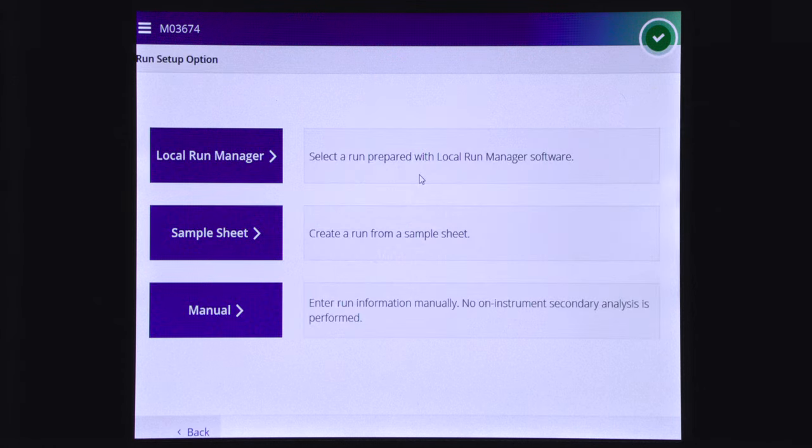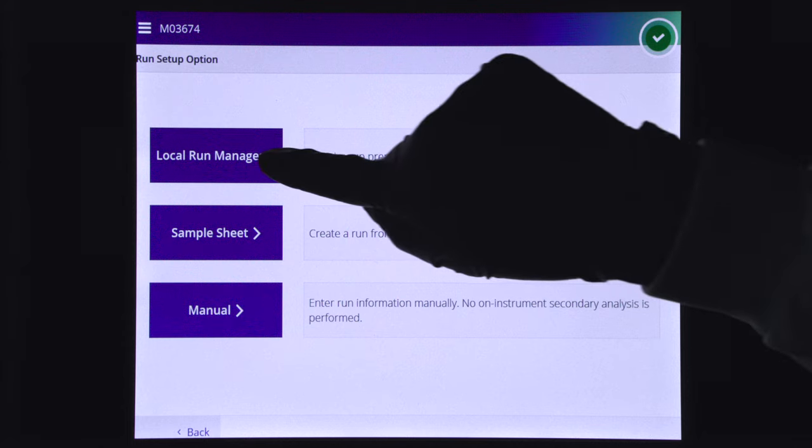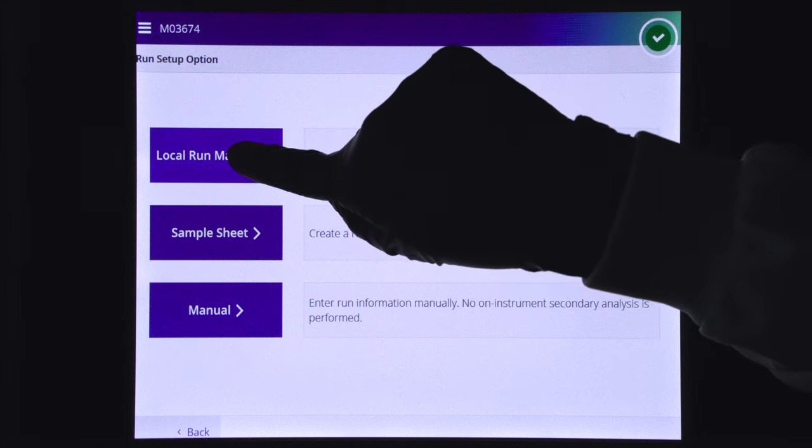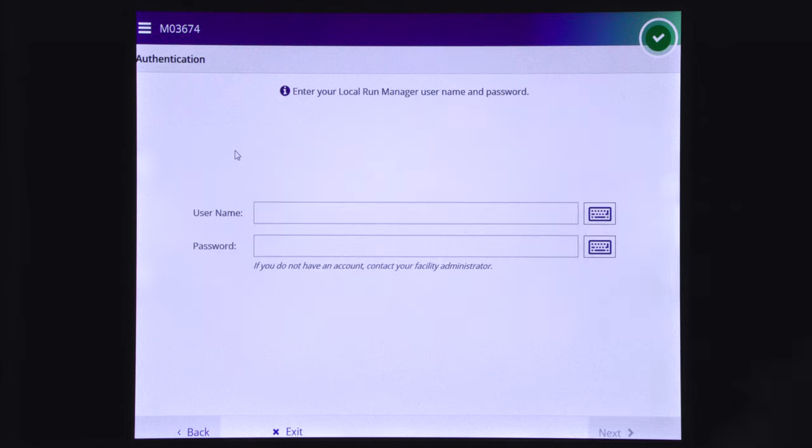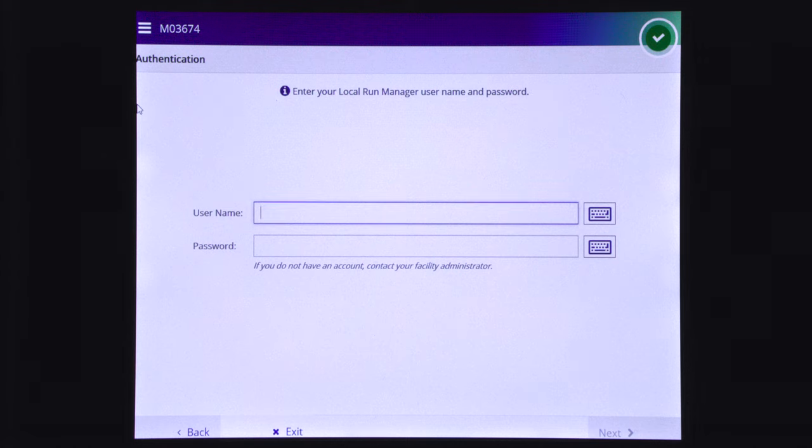From the sequence mode selection screen, select local run manager. Enter your local run manager username and password and select next.